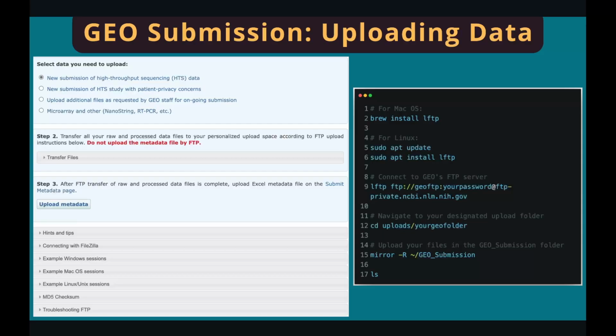And once you have all the files, it's time to upload. Although there are some tools that have a graphical interface, I don't recommend using those tools. They are quite complicated to set up, and you don't know if all the files are uploaded or not, so they're hard to use. So let me show you another way.